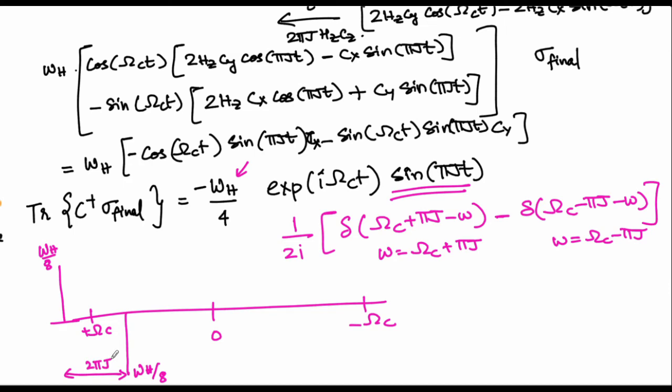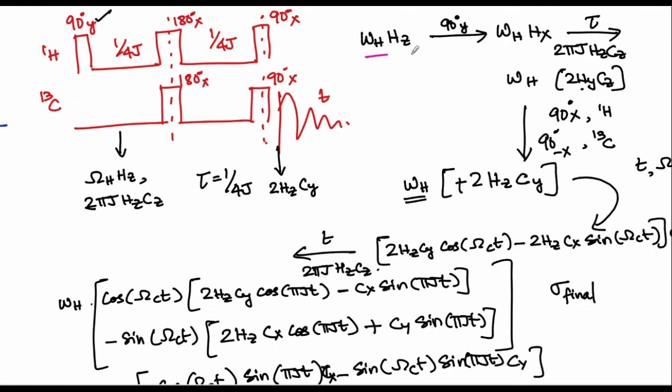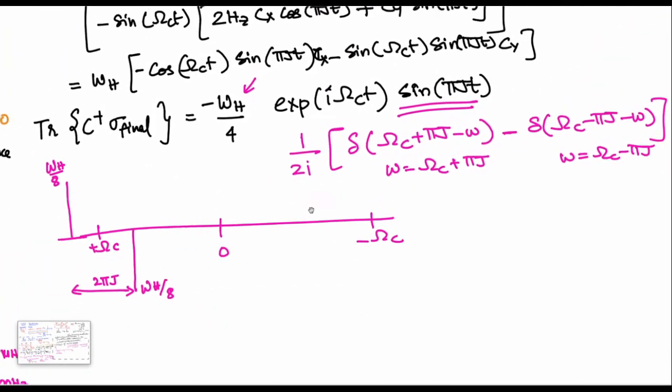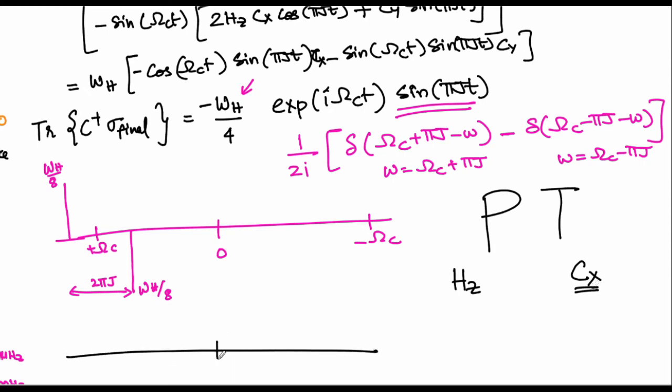This is an important outcome, and remember, this has come solely from the proton magnetization. This is exactly what is termed as the polarization transfer, meaning that you started from the proton polarization and you are able to observe carbon magnetization, finally coherence actually in this case. The main difference between whatever you obtain directly from carbon, let's draw that right now.